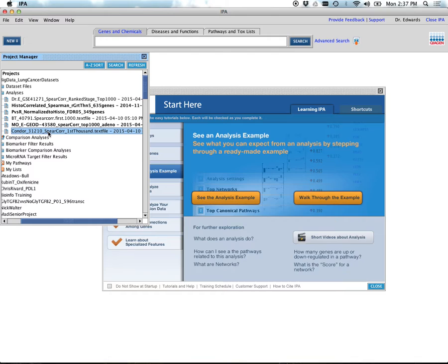How do you add those in there like that? What's that? Is that the actual file? Yep, that's the actual file. So you just import, just like you did with your gene list. It's the same thing we did with ours, but with BTs or MOs. Right, and remember you have to know which platform they used. You have to click Affymetrix or Illumina, depending on which platform you use. That's exactly what we're doing.